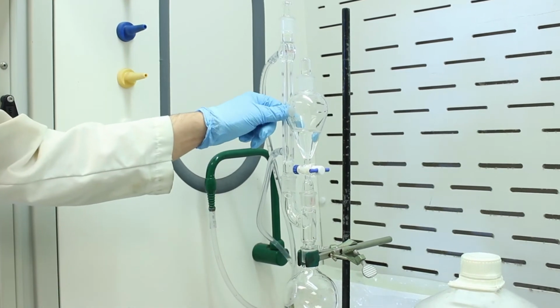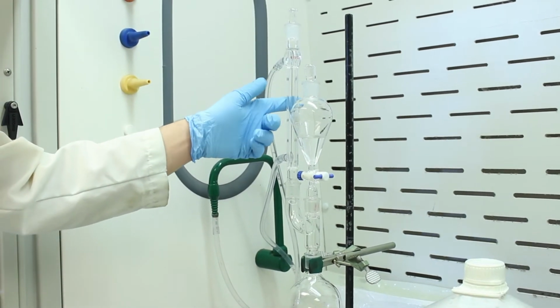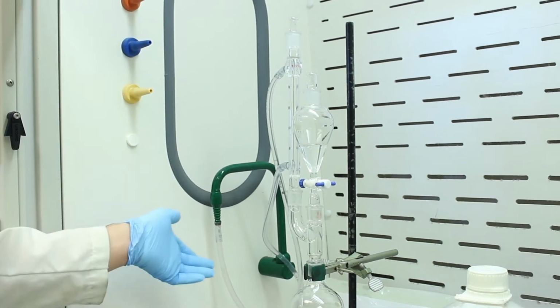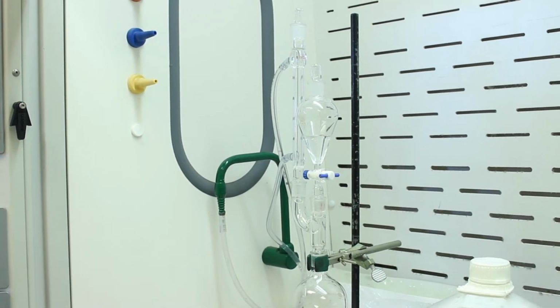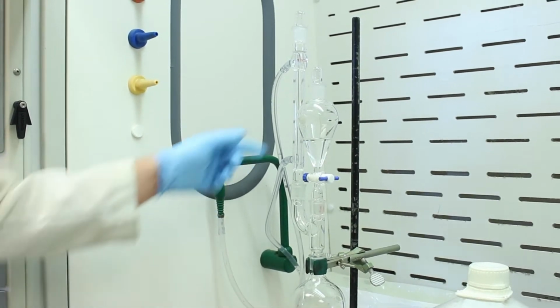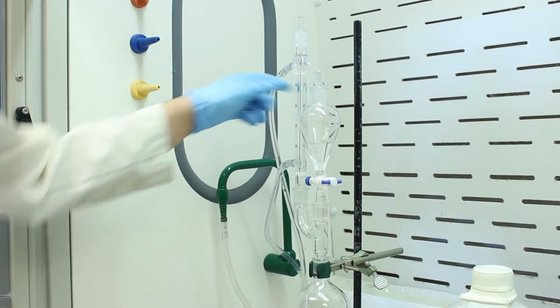And you'll notice we have a condenser here. So this condenser is going to help keep the vapor, the ether, from leaving, though it's not very effective here in Hawaii because the tap water here is very warm and diethyl ether evaporates at just barely above room temperature. So it's going to do something, but we're still going to lose some ether.